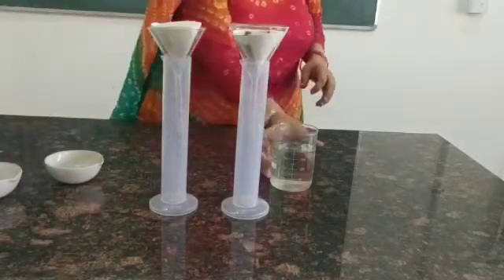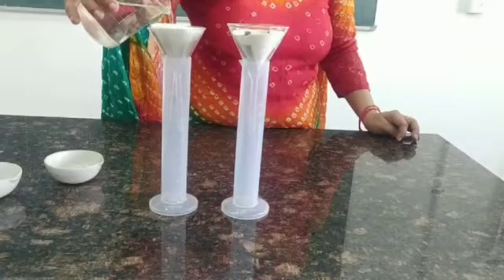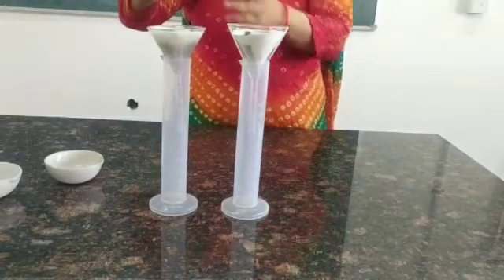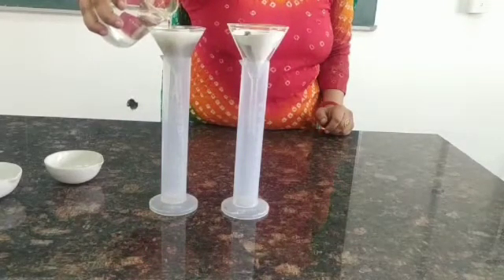Now we will put water into it. While putting water, we have to make sure that the water is slowly transferred into the funnel so that it drips down slowly through the funnel.